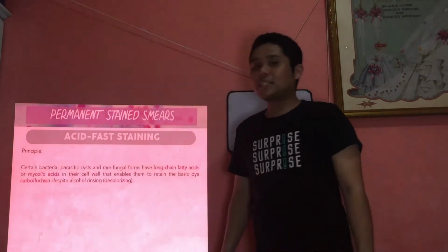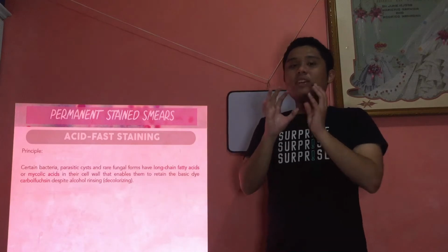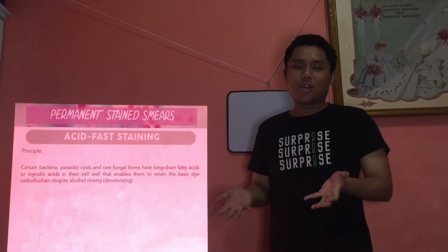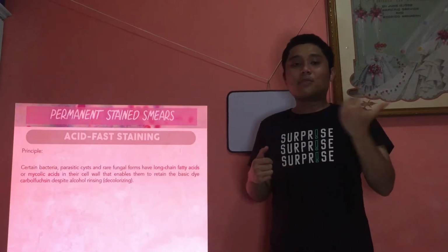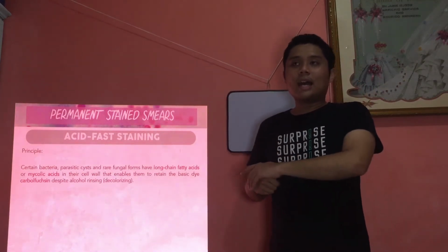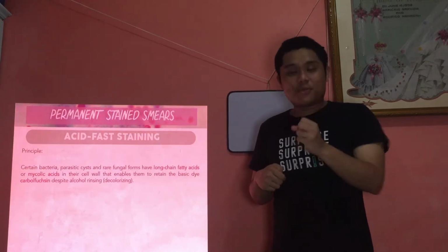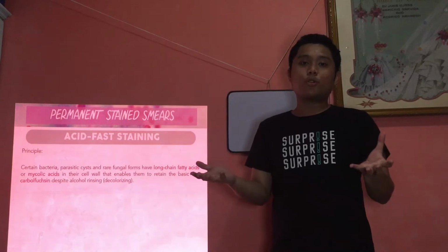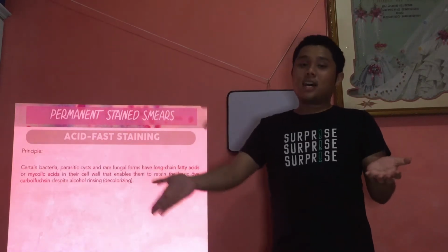For the principle of acid fast staining: acid fast staining is another routine staining method used for bacteria. Do you recall what type of staining technique it is in terms of method? Is it simple, differential, or special? It is a differential stain. Why? Because it divides the bacteria into two groups. It could be acid fast or non-acid fast.